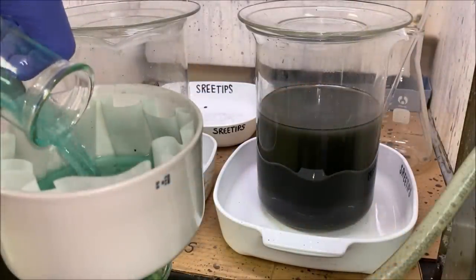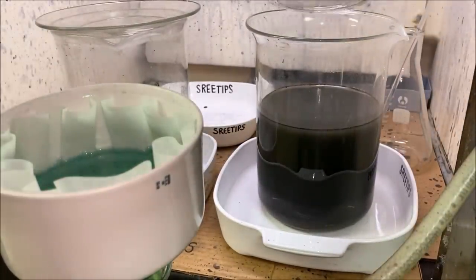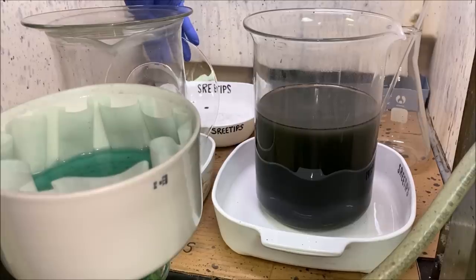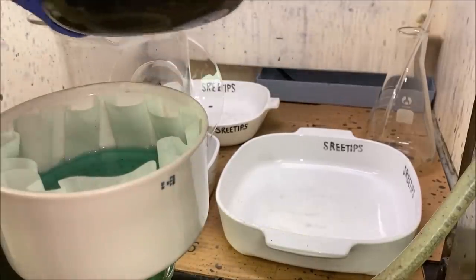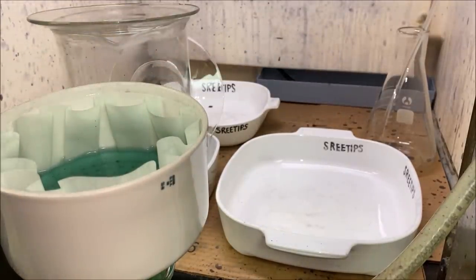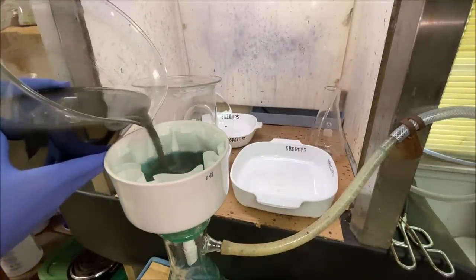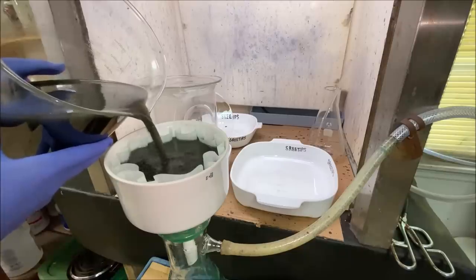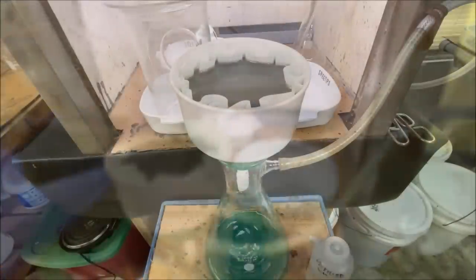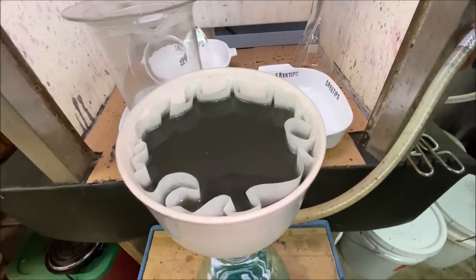All right, I've got all this solution down into the filter now out of my vacuum bottle. So the next logical step here will be to start filtering the solution out of this beaker. This is just going to be water. And we're going to start filtering this now. This will probably load the filter up and slow the flow way down. Yeah, the filter's loaded up now and just dripping a little bit at a time.